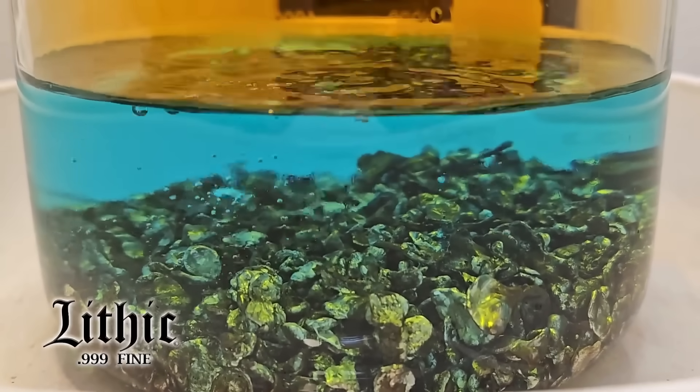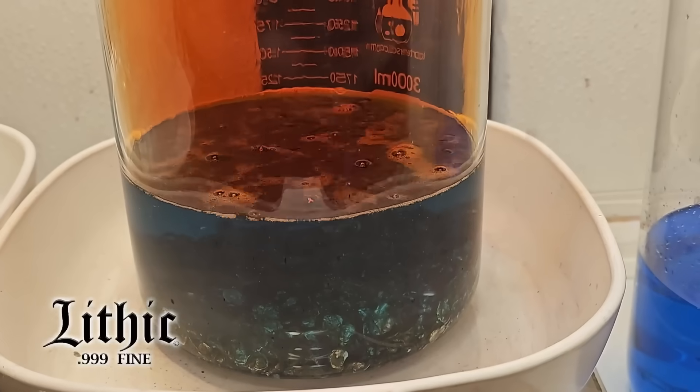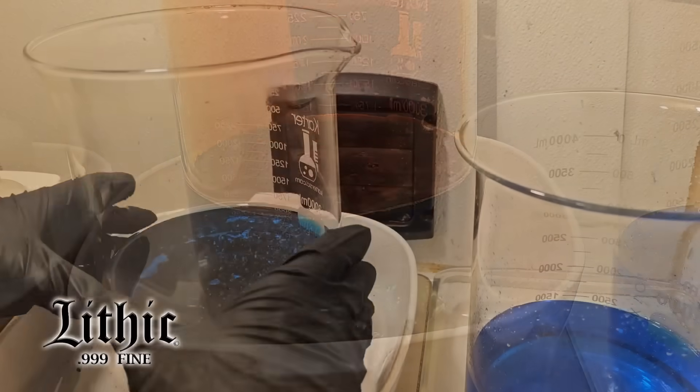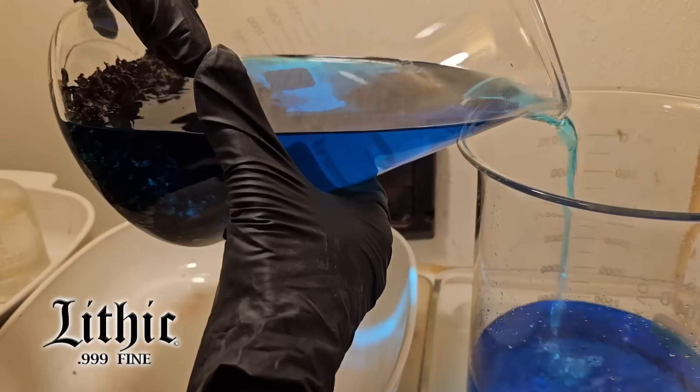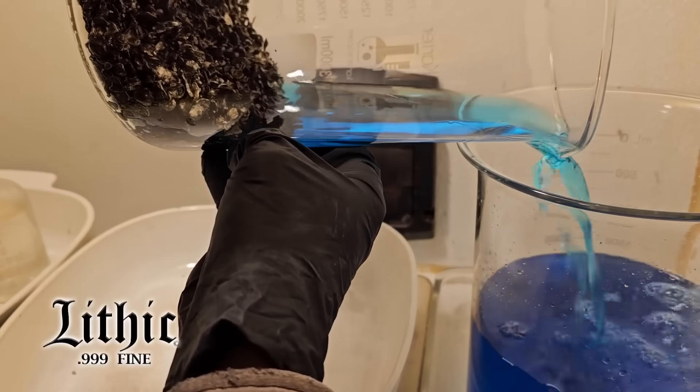Taking a closer look: the gold is staying put, but the silver and copper — those base metals — are getting pulled off and dragged into solution. Every time I feel the solution saturate enough, I pour it off to the side and begin again.